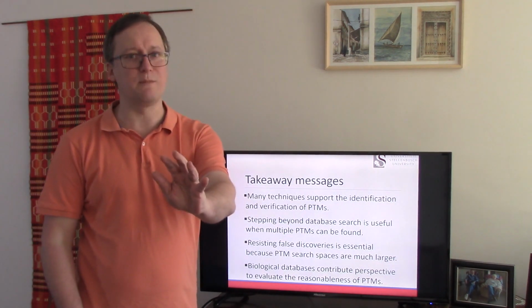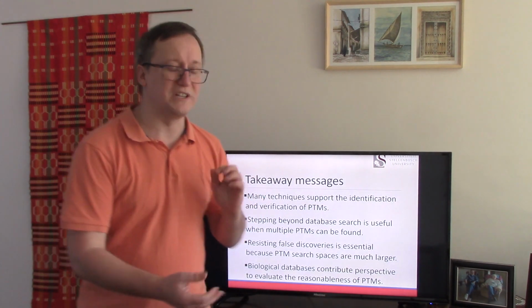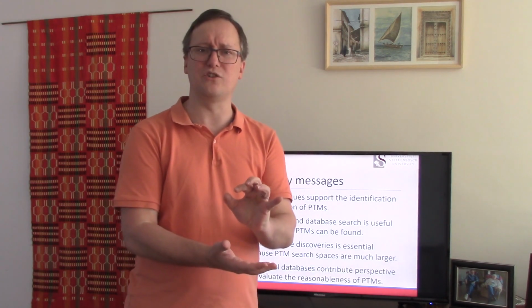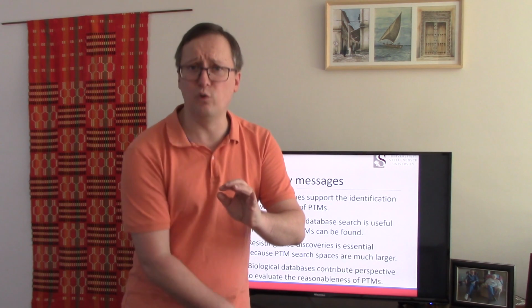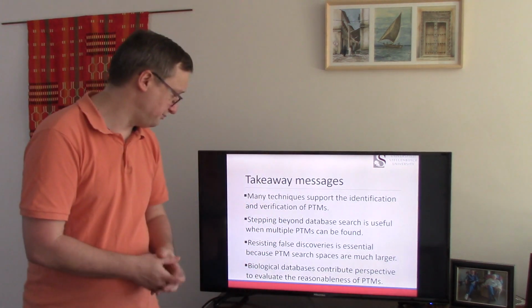It's not just going to take more time to run the search. It's going to give you a sensitivity hit, losing some identifications that were on the edge with standard protein ID that fall away as soon as post-translational modifications broaden the search space.